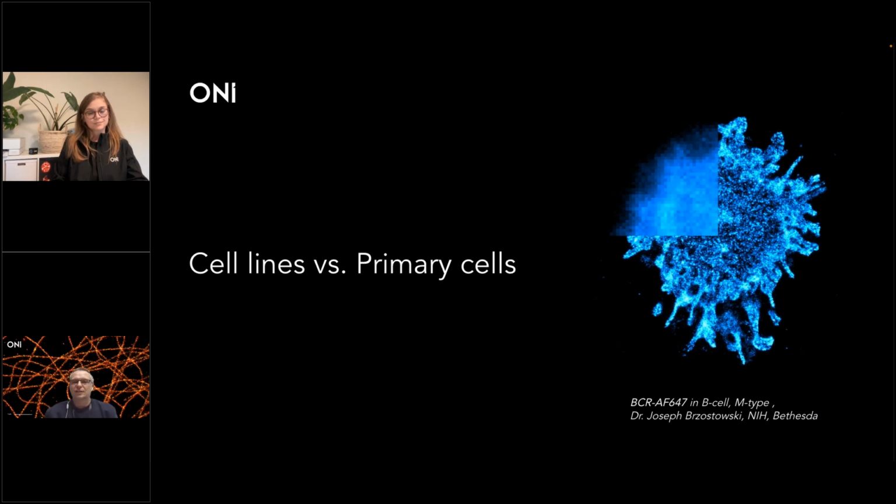Another option is using collagen. You can use collagen with a different stiffness. But again, you need to pay very close attention to the depth of your collagen. As I mentioned earlier, if the working distance of a 100x objective is around 140 to 170 microns, your collagen cannot be thicker than maybe 30 microns. The glass will be around 110, plus 30 microns of collagen, and then your cell is sitting on top of the collagen. You can also use fibronectin, but please keep in mind that the depth of your collagen or stiffness will matter, because that corresponds to your imaging.